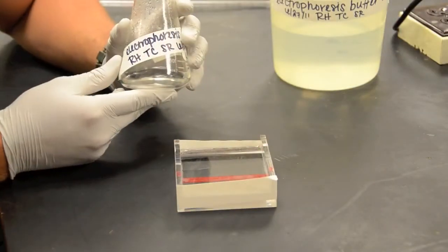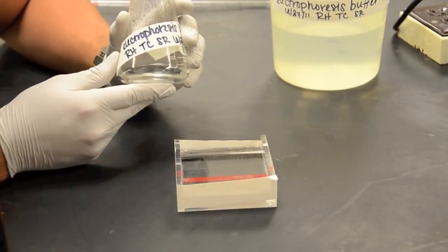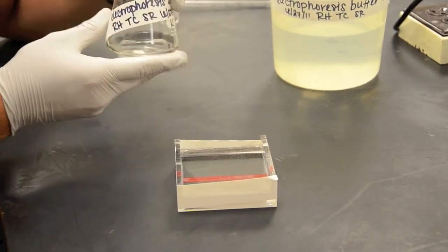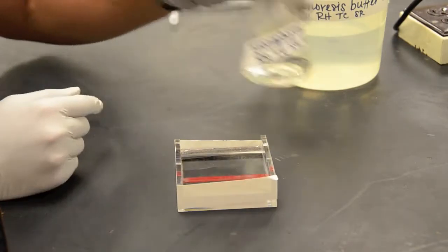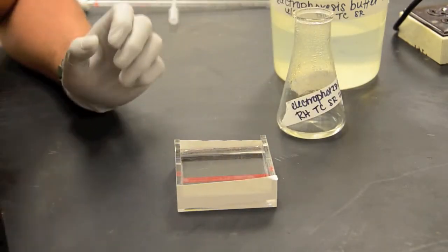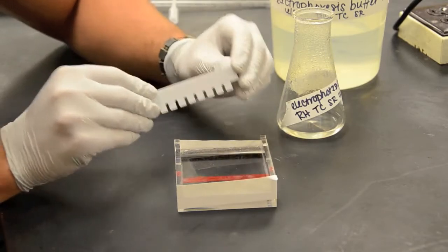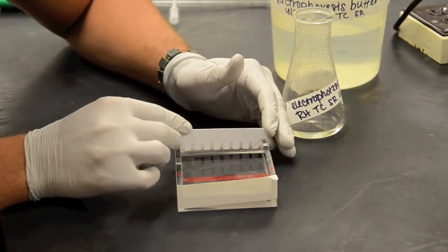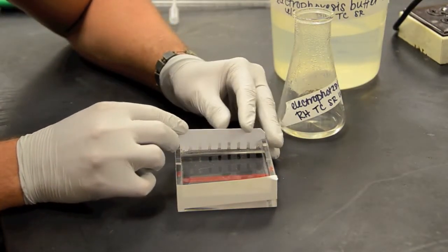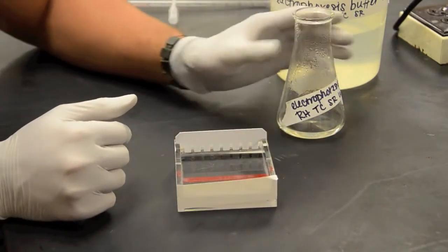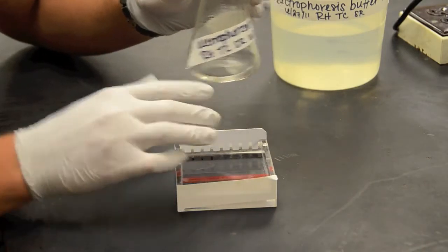Okay, once the agarose gel is done warming in the microwave we're going to let it sit out until it's cold enough for us to handle. Now we've got our comb here. What we're going to do with this comb is load it where the black band appears and what this is going to do is help create our loading wells for our dye whenever we add the agarose gel.